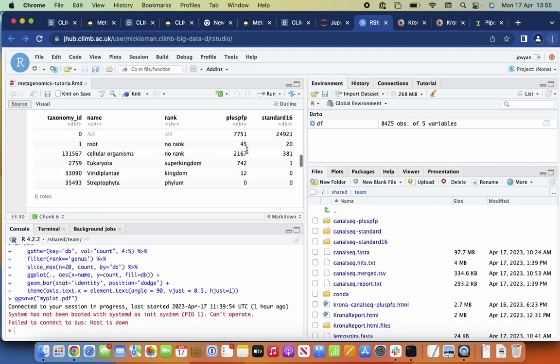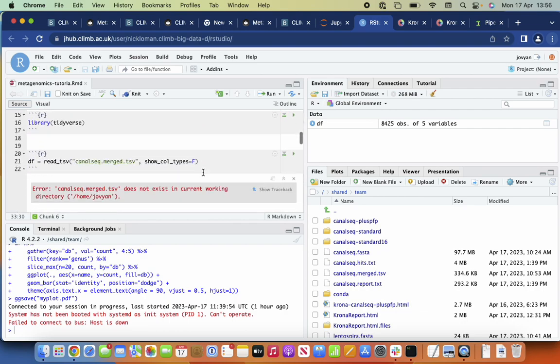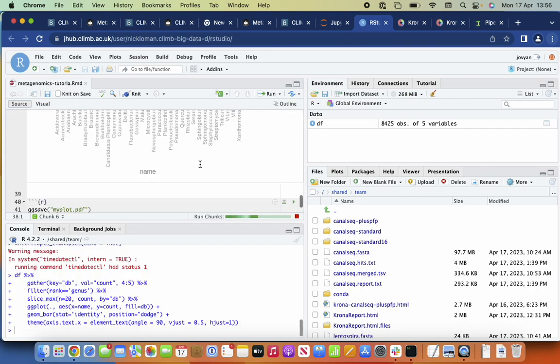And this is just an example. Again, in RStudio, we've got the same volume store there. All the data is already available. We have to pull it into RStudio. It's working off exactly the same kind of virtual hard drive, and we can have an R notebook in a similar way to a Jupyter notebook, and do some plotting of those results.